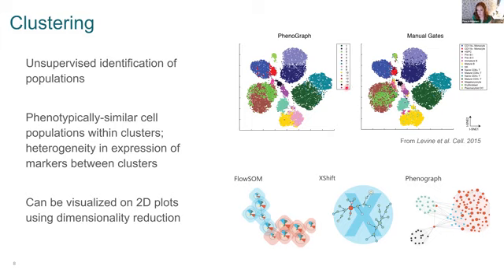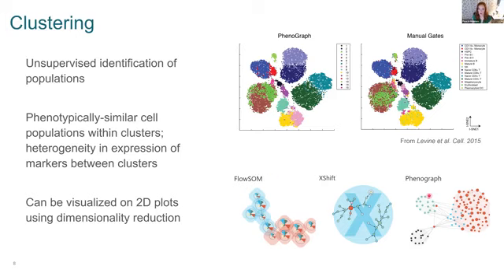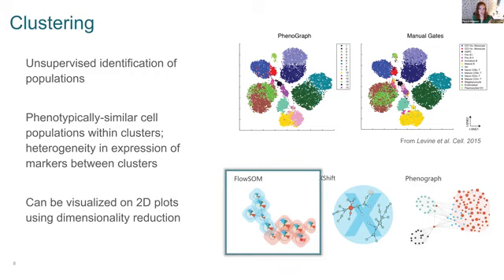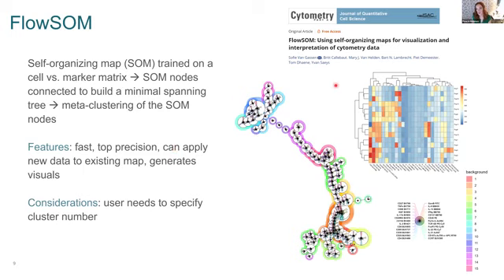We can visualize the relationship between clusters by putting them on a dimensionally reduced plot like t-SNE — just two parameters, t-SNE 1 and t-SNE 2. We can appreciate that, say, cluster 4 and cluster 2 are in the same island, meaning they're variants of the same cell type. You'll end up with phenotypically similar cells within a cluster and lots of differences between clusters. Clustering options available in FlowJo are FlowSOM, X-shift, and Phenograph — you can visit the webinar library for detailed information on each.